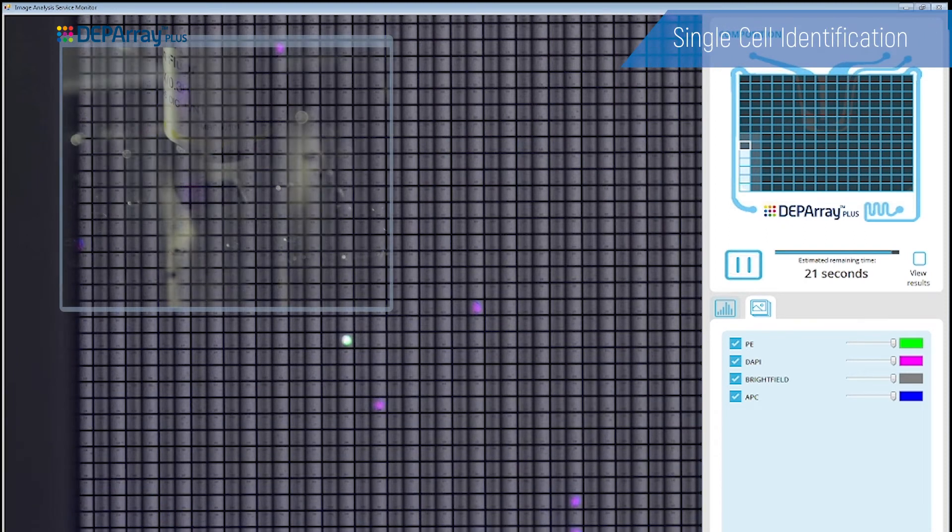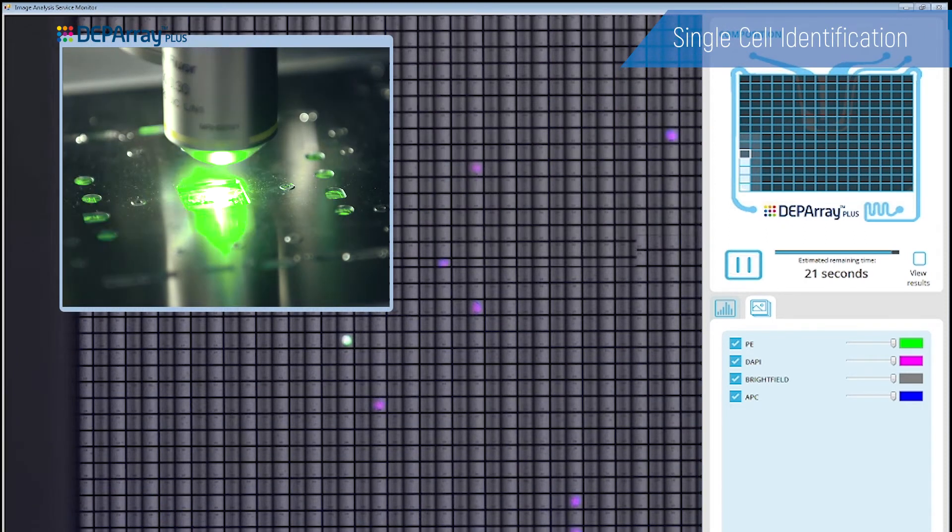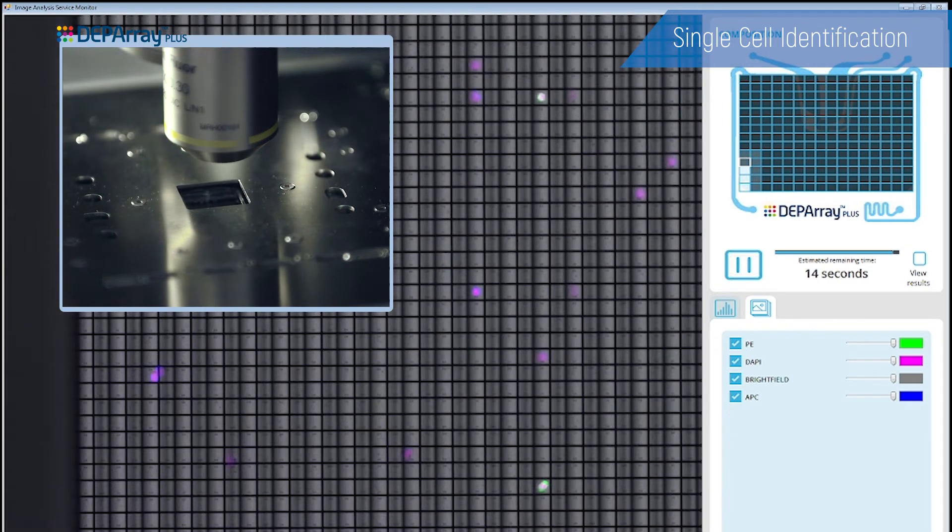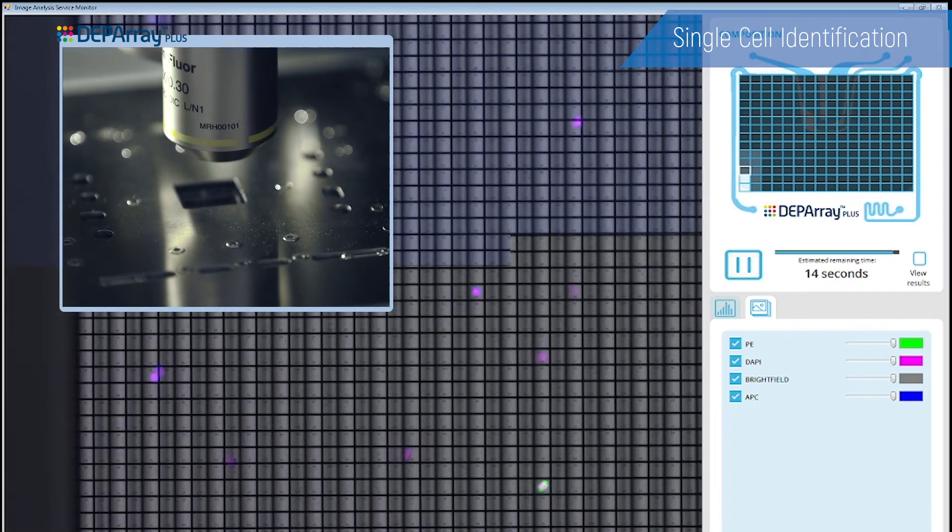Once cells are trapped in DEP cages, single cells are identified and selected based on their fluorescent markers, thanks to a 9-channel fluorescent microscope and a high-resolution imaging camera.